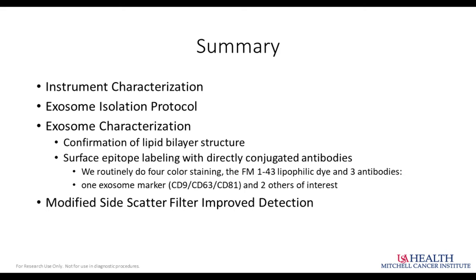And again, you can use cerebrospinal fluid. There's lots of different things you can do. One thing that we did test early on and that we feel is very critical for obtaining blood from patients is that we want to stabilize that plasma with a protease inhibitor as fast as possible.